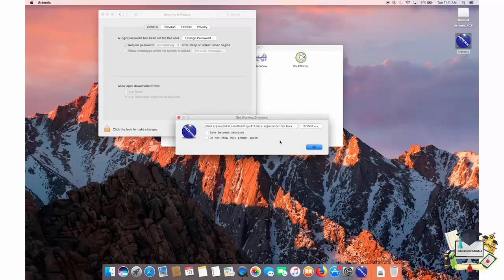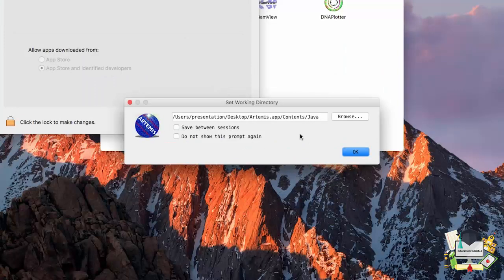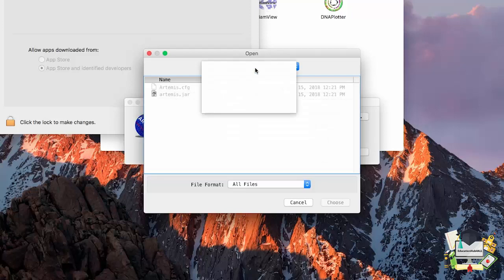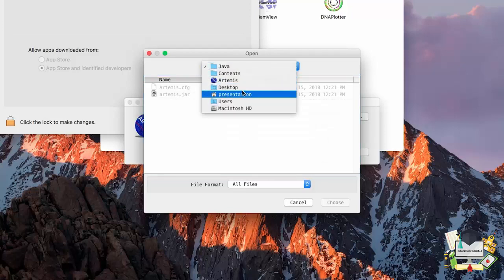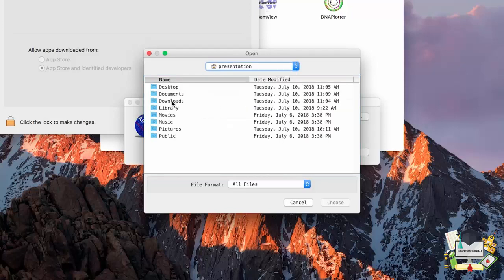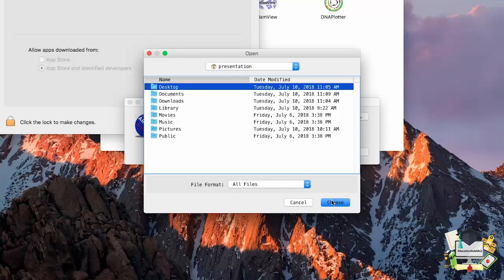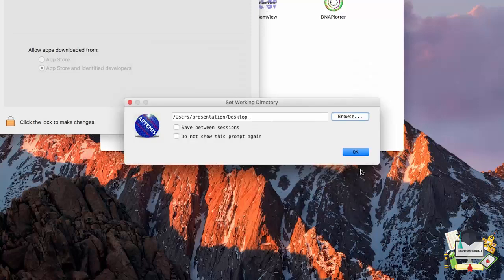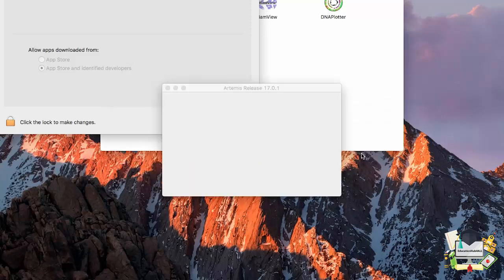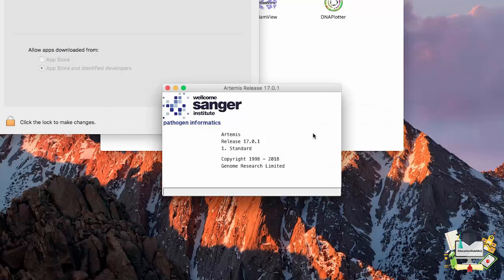Artemis should now open. Again, we need to set our working directory. On a Mac, this defaults to the Java folder under the Artemis app directory. I want to change this to the desktop. To do this, I'll simply browse, go to my home directory and select the desktop. Now click on OK. And again, the Artemis window comes up.